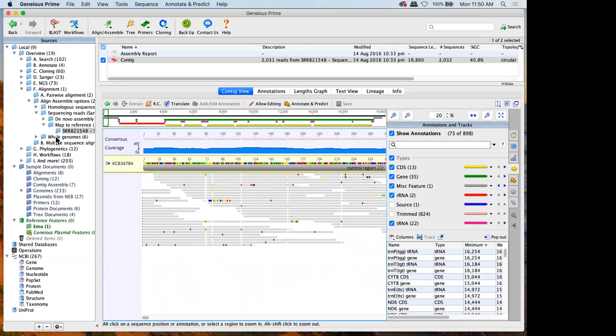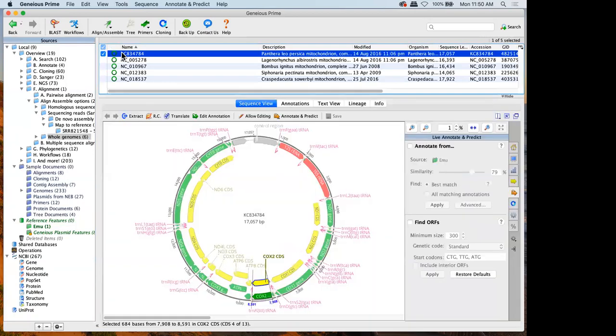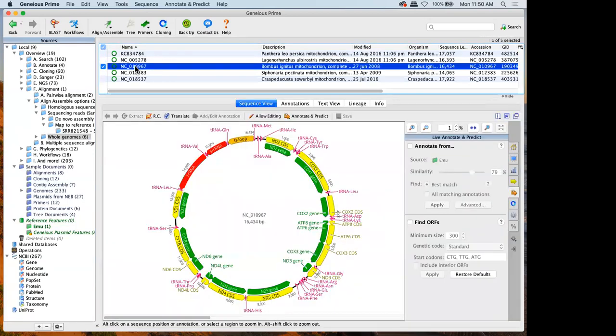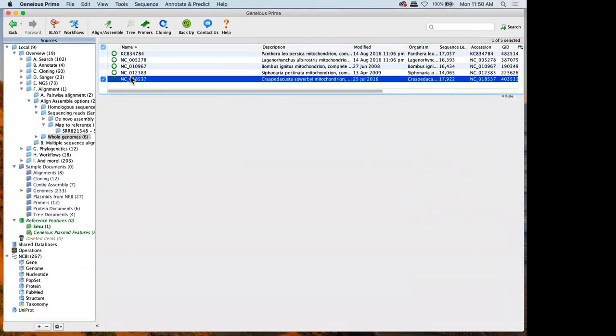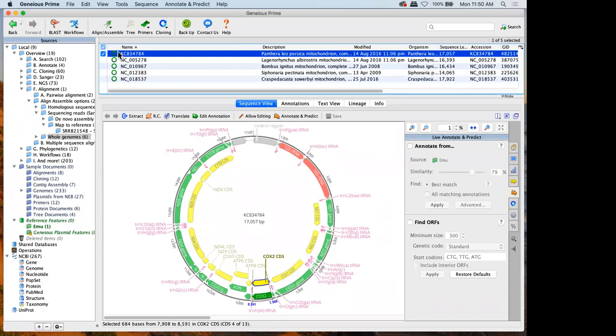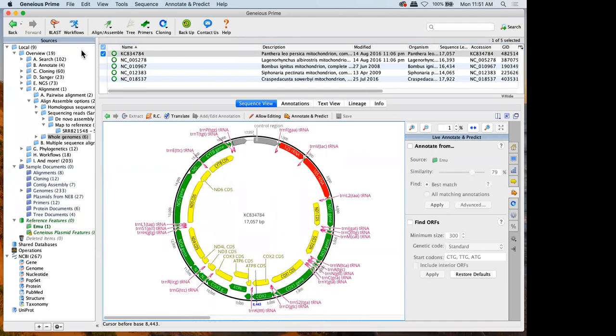And then the final option, or final case you might find yourself in, is where I've got, again, that mitochondrial genome, but this time I've got the mitochondrial genome from other species as well. So it's a much larger piece of sequence, and whilst they're generally expected to be similar, maybe there's rearrangements. Maybe these genes aren't in the same order across all these species. And that's when you want to use something like align whole genomes. In particular, there's two plugins here.